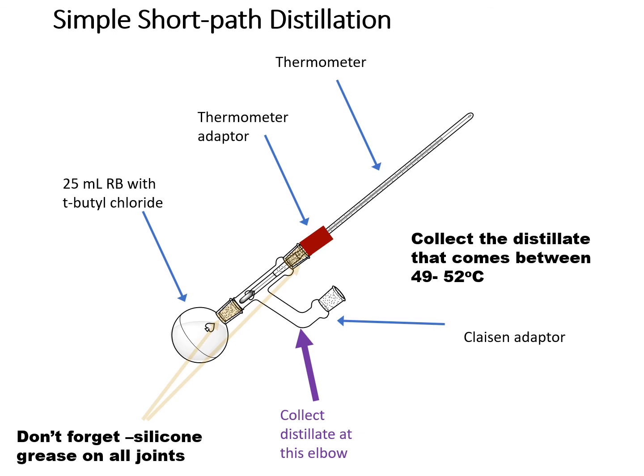Here, when you assemble this apparatus, please remember to grease the joints so that you will not have any blockage as a result.